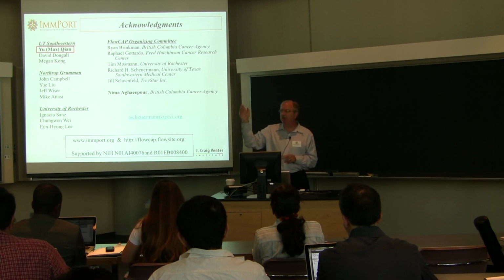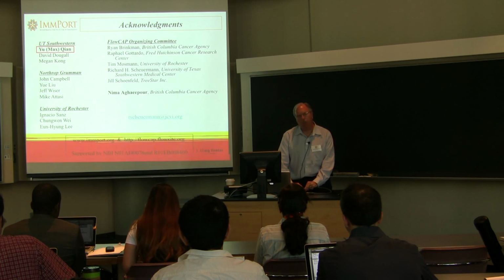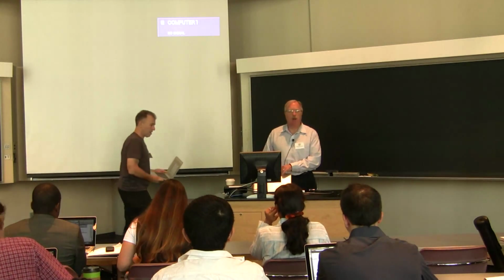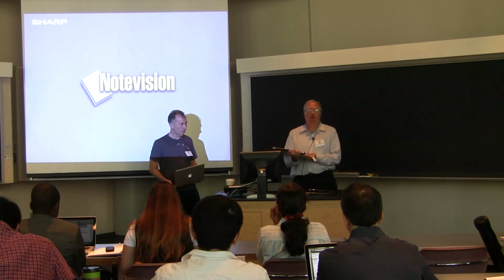If there are any questions while we're transitioning. Yeah, with your algorithms, can we interface with FlowJo or something, so that if you want to override the results of the algorithm, you can manually? Yeah, that's a good question.